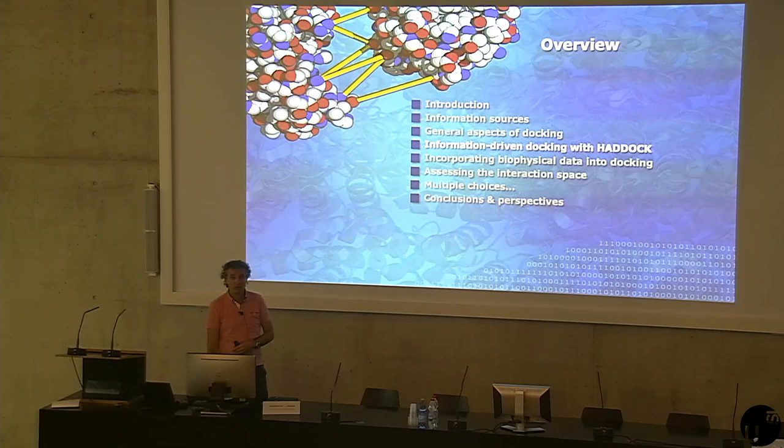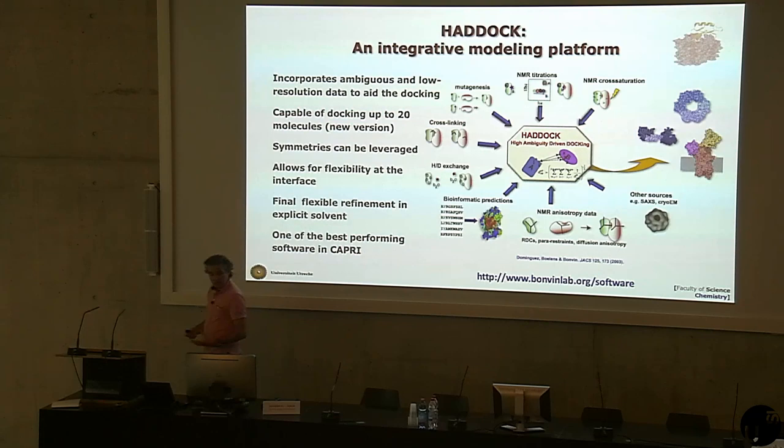So Haddock has been developed for more than 15 years now as an integrative modeling platform. And you find back here all the experimental data sources that we have been discussing. So we can integrate all of this data in some kind of energy function. Currently, the new version of Haddock is able to handle up to 20 different molecules at the same time. So we're not speaking only about binary docking, but we can build multi-component assemblies in one go.